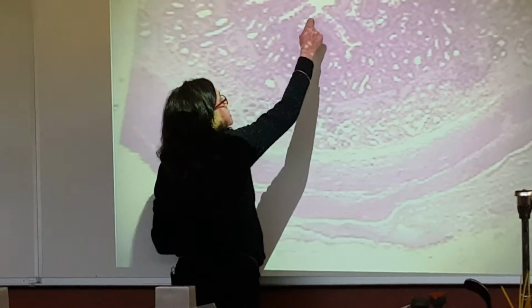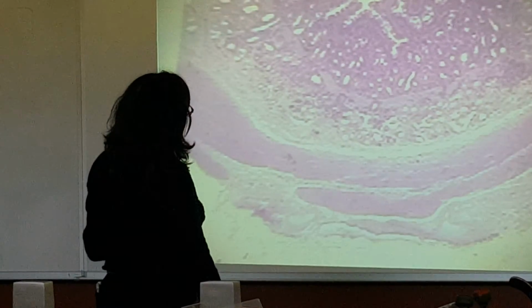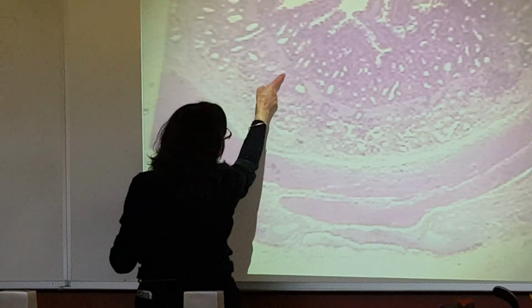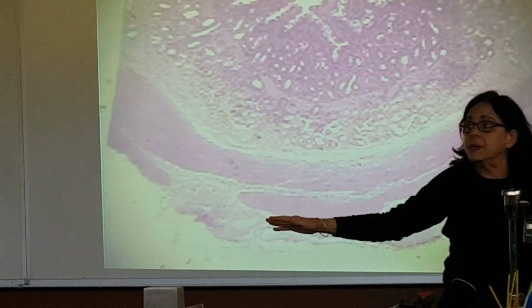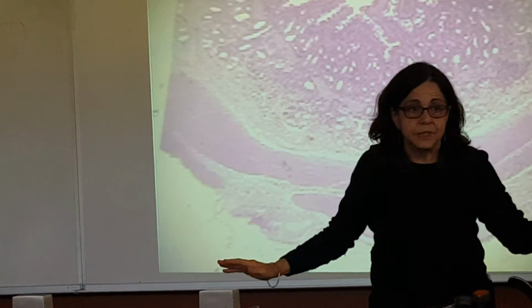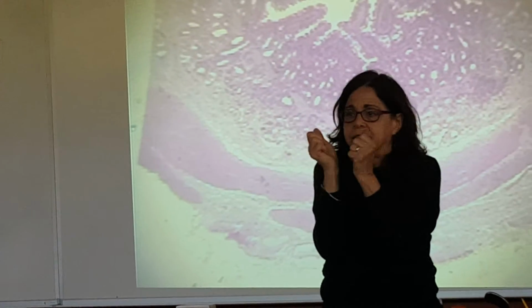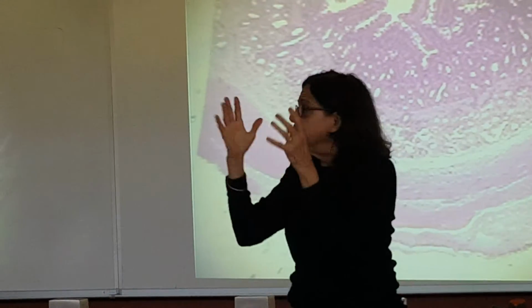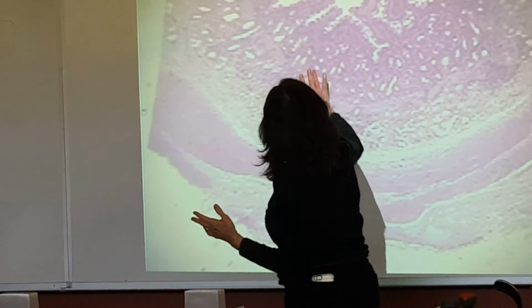It's got the epithelial cells, it's got the lamina propria, and then it has a border of muscularis mucosa, which helps move the surface of the intestine as it contracts. It maybe can wave the villi around, so it allows for more movement. So all of that is mucosa.